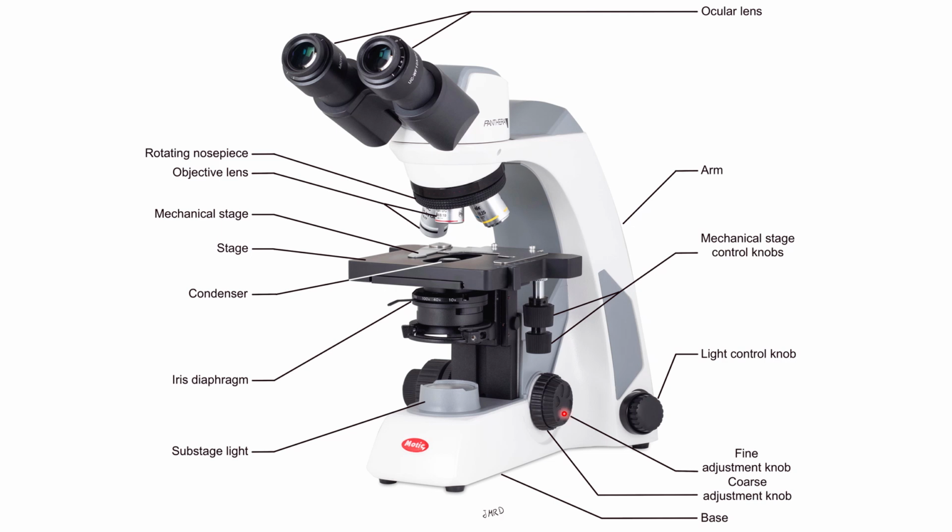And fine focus is going to make slight adjustments in that differential. So we typically use that on our highest powers because we don't want to smash it into the objective lens.